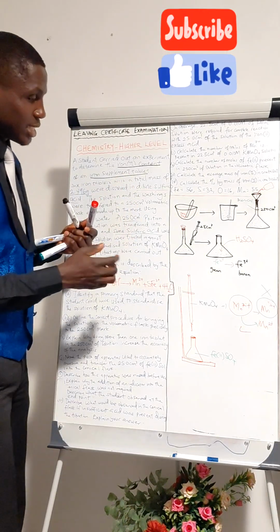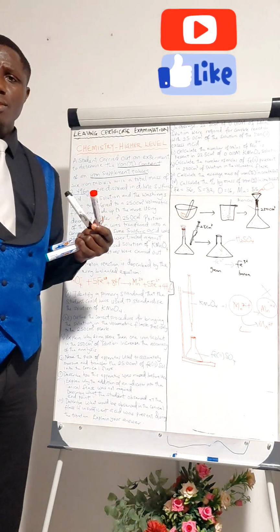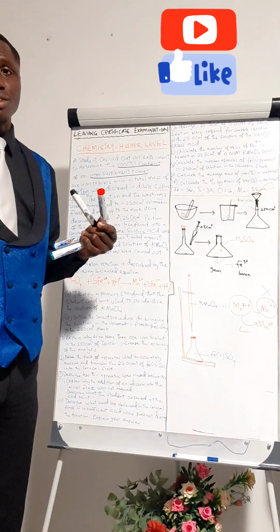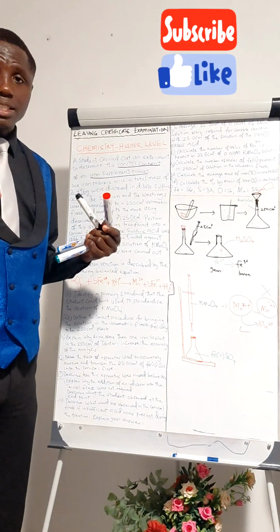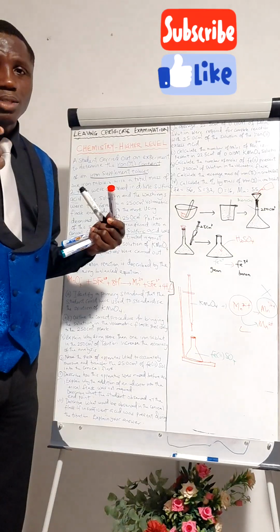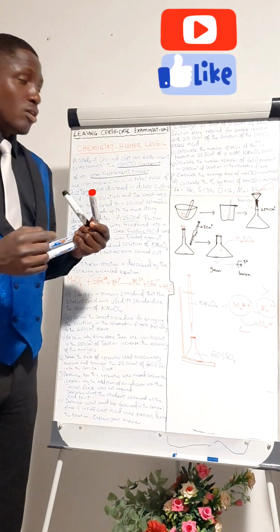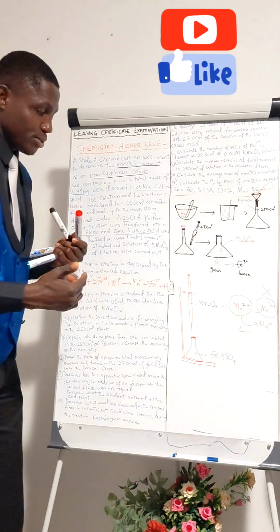So that's number one: it gives you a better mass of the analyte, as you are using more tablets, and its concentration is being represented very well in your solution of iron sulfate. So that's that.